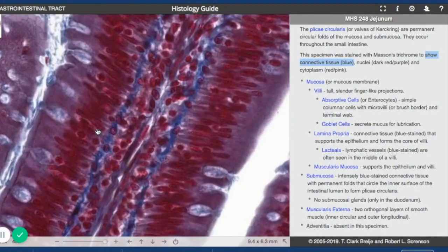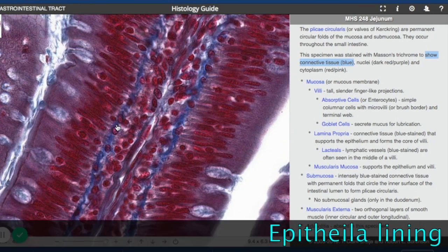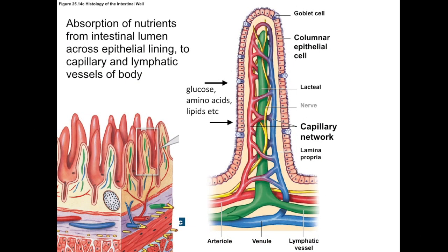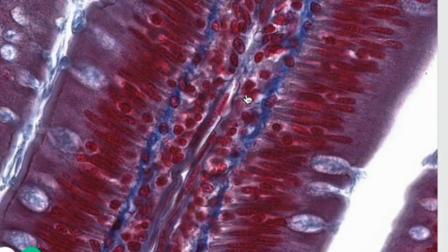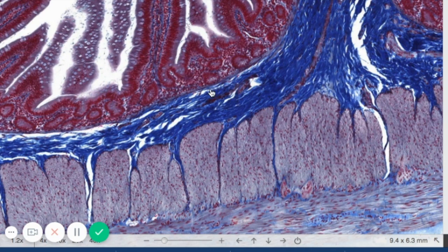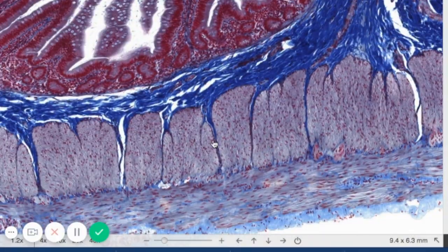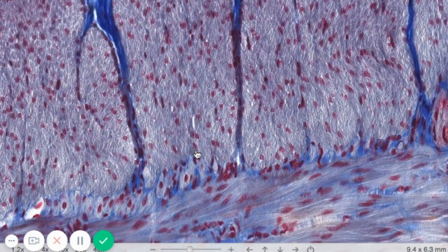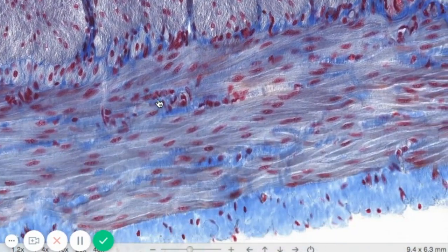Here, you can see the epithelial lining underlying the lamina propria. This area of the mucosa is going to contain capillaries and lymphatic vessels that take away the digested products that these epithelial cells have absorbed from the lumen. The boundary between the submucosa and the muscularis externa is also very obvious in this sample, and it also has a very clear and distinct boundary between the inner circular layer and the outer longitudinal layer. In the outer layer, you can actually see the overall cell shape, though usually you're only able to see the nuclei.